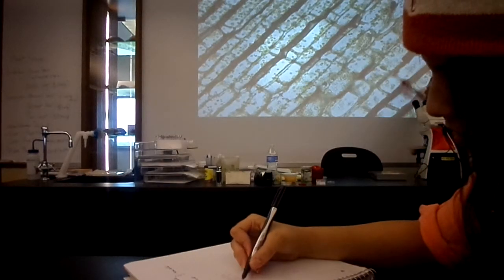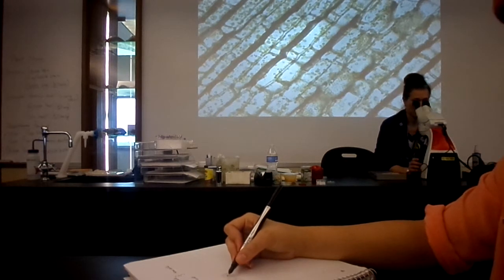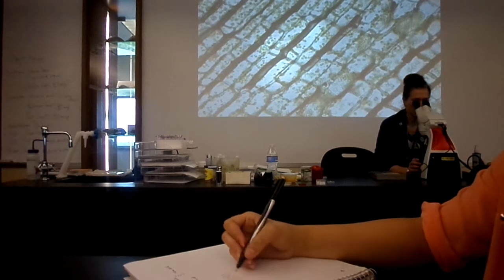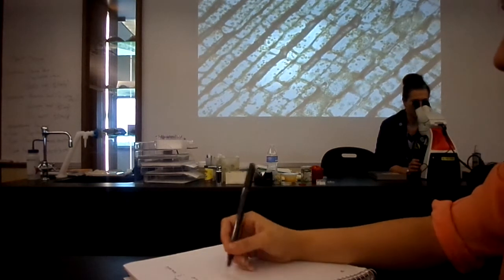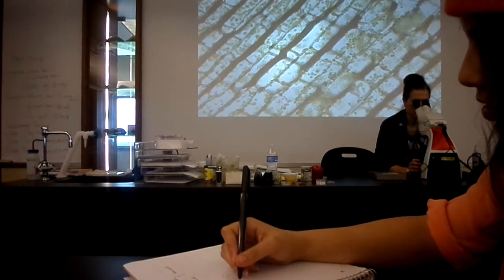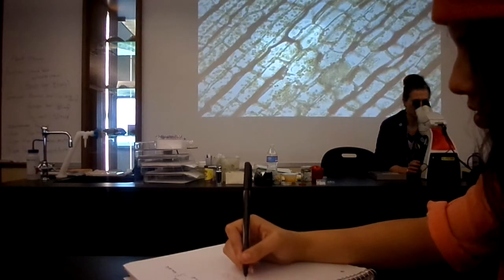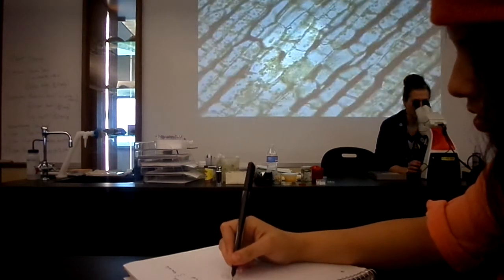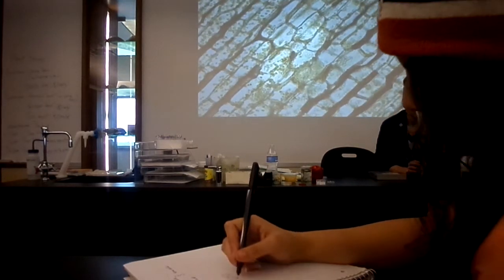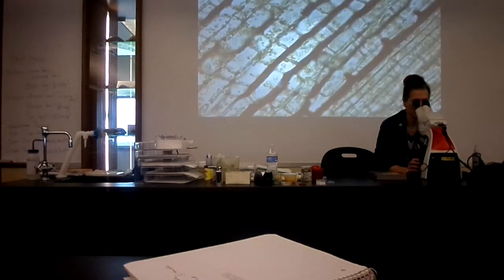The movement, and if you get a certain one this morning, what made it look really cool was you could see the nuclei moving. The nuclei don't stain, but they're transparent little spheres, and you can sometimes see those guys moving as well. This is really kind of cool. They were really moving pretty good this morning.